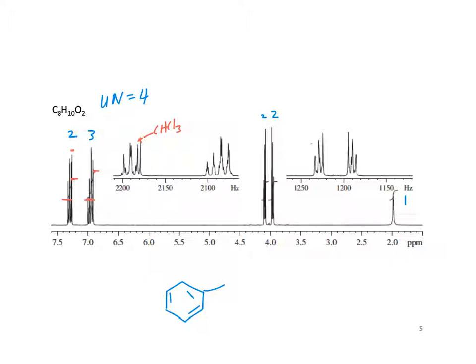So these two are looking a little second order, right? They don't really look quite like the patterns we would expect. So what do you think about those two? They're equal in integration, or they're coupling with each other, right?